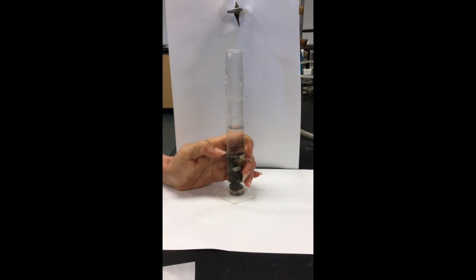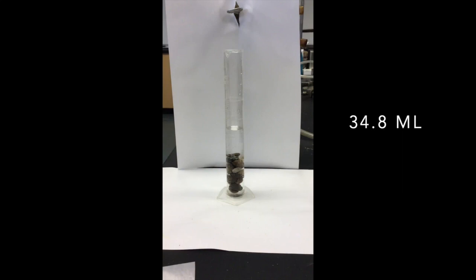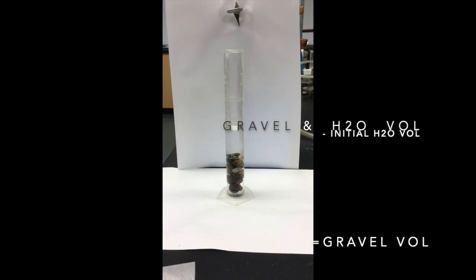This is just below 35, so it's between 34 and 35 ml, and again I'm going to estimate where the bottom of the meniscus is. I'm going to call this 34.8 milliliters. Now, by subtracting the difference of my two volumes, I can calculate the volume of the rocks.